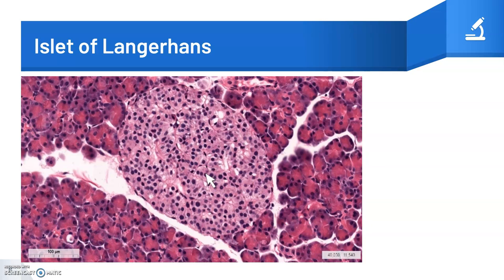The endocrine counterpart of exocrine tissue are the islets of Langerhans — the functional units of the endocrine pancreas. The endocrine cells occur as irregular cords surrounded by fenestrated capillaries. In hematoxylin and eosin sections, islets appear paler than their more abundant exocrine counterparts.